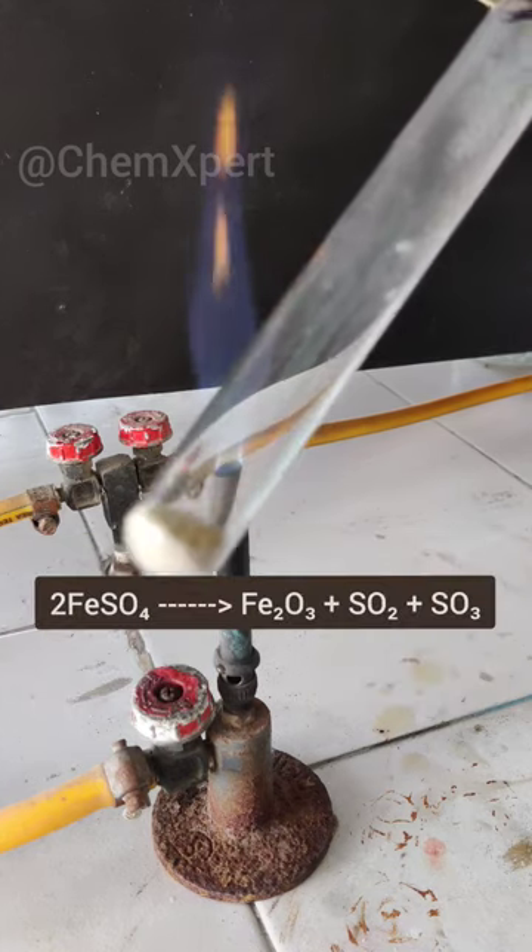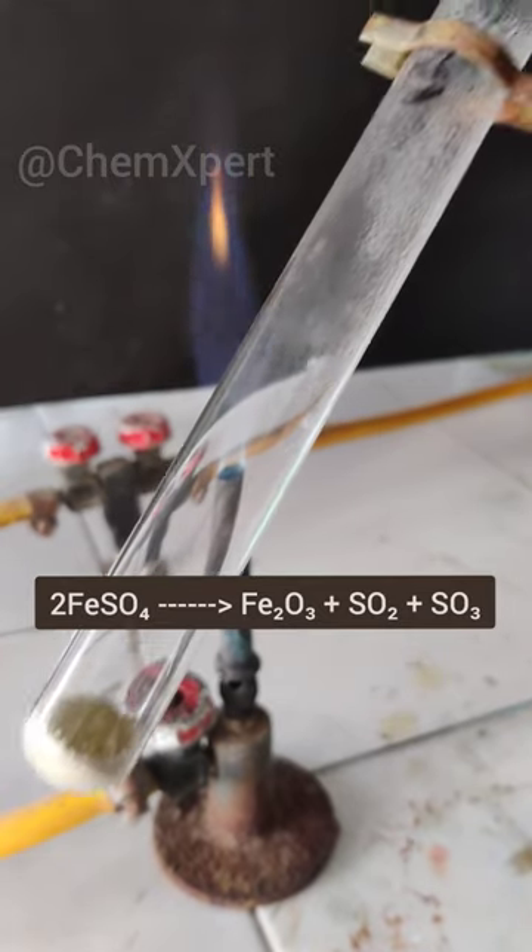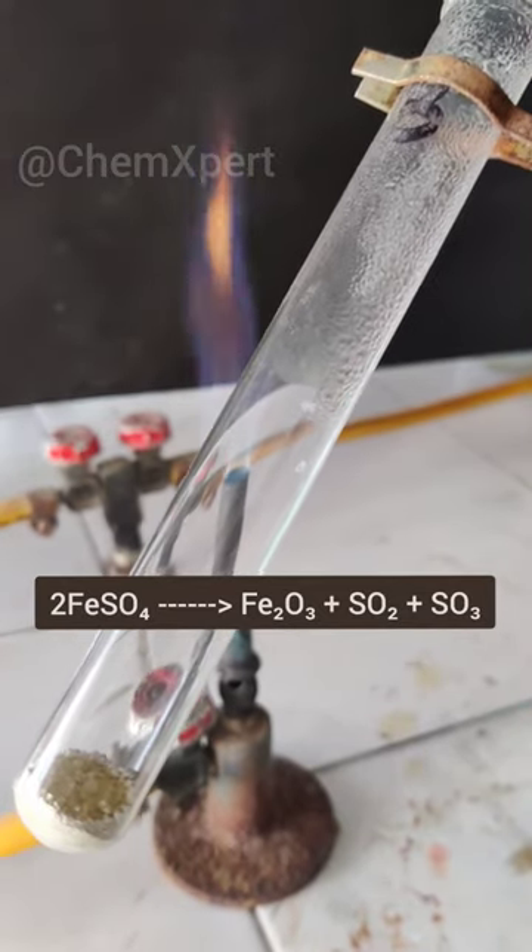On further heating, brown coloured ferric oxide is formed, i.e., Fe2O3, and gases like SO2 and SO3 are evolved.